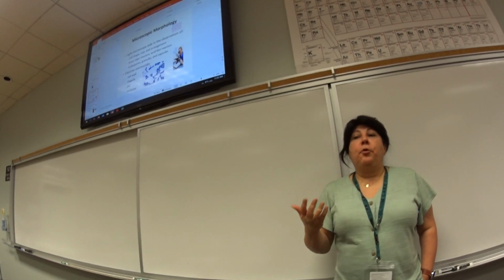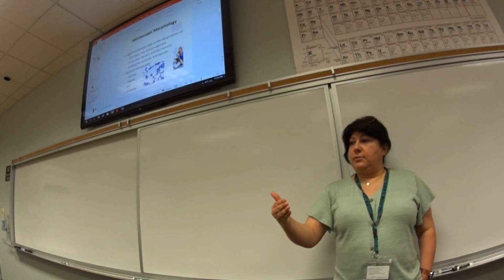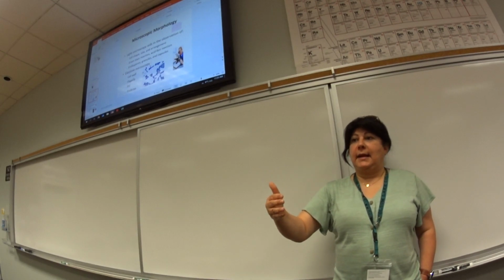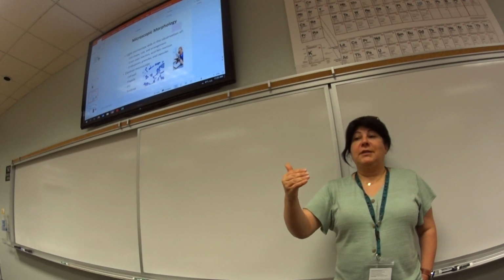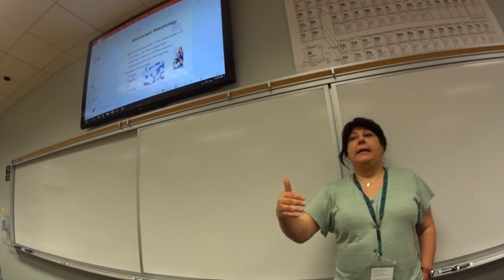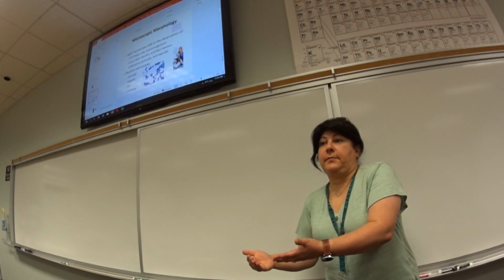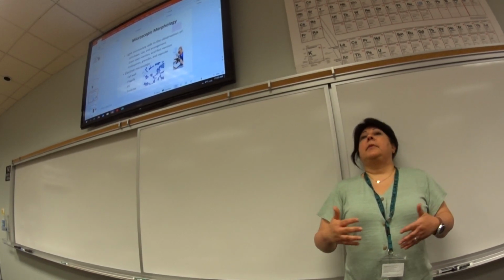The reporting is going to be done as if I have given you this as a research project, as a lab tech, and you're doing it. In a research project as a lab tech, notes are taken every day, and pretty much a conclusion is made every day, and what you do the next day is based on your conclusion of the previous day. That's how I want this to be done.